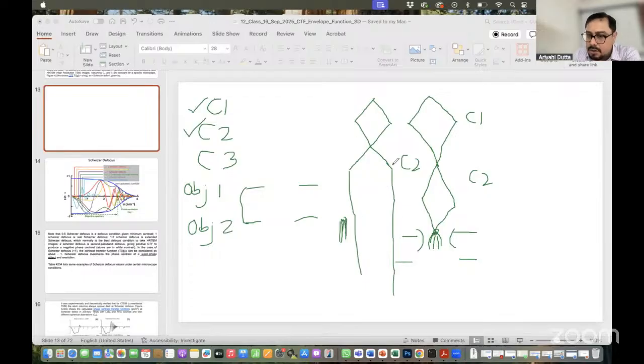So there are two ways to do it. In this particular case, you are making your lens so under focus, the C2 lens current is so under focus, that your beam looks semi-parallel. The other way is that you make the beam cross over here, with the magnetic field in such a way that it takes only a small place, this small crossover point, and all the electrons go in a straight fashion. They cannot deviate in any direction. This is how you make the beam parallel.